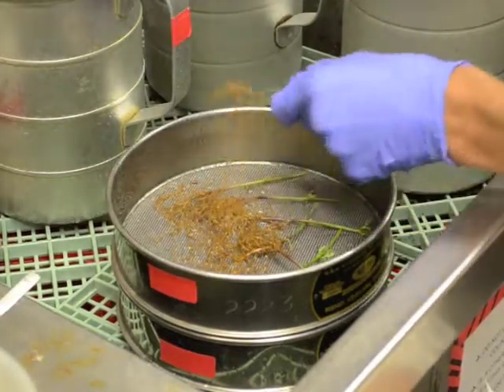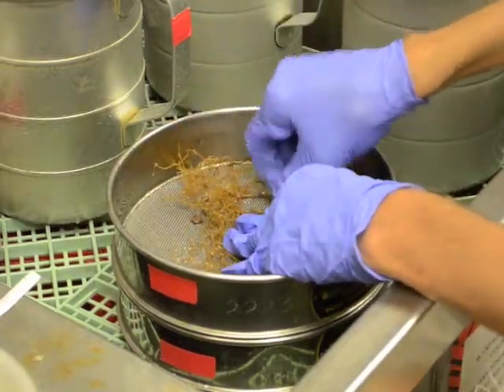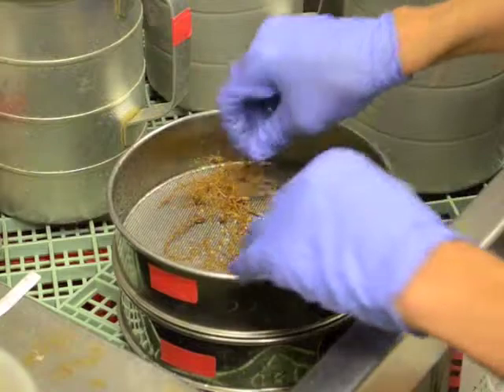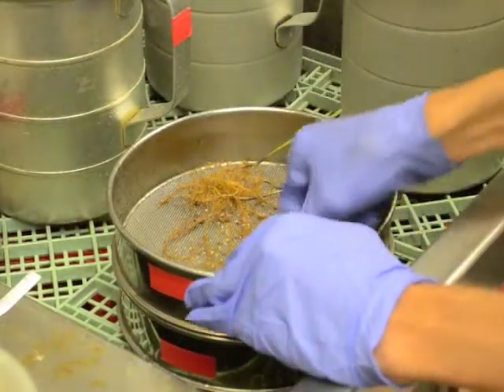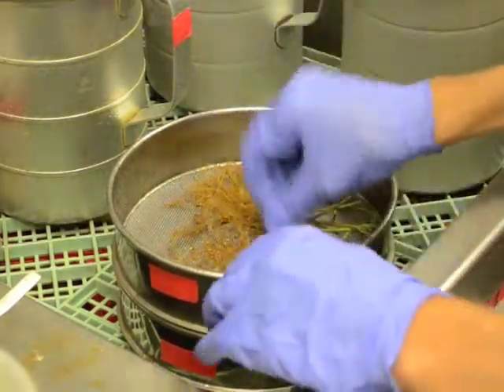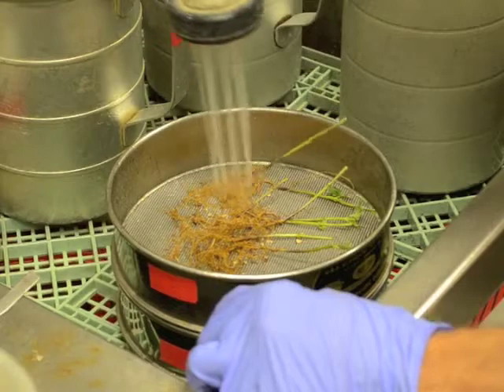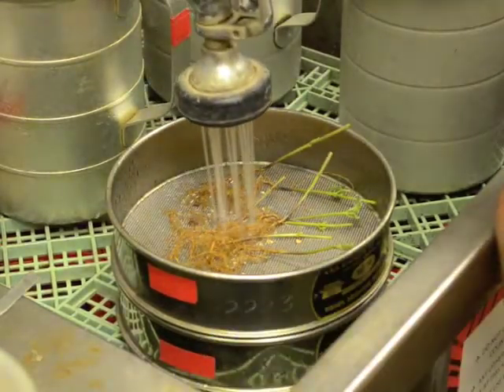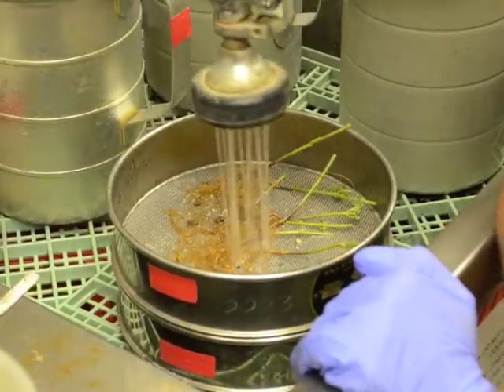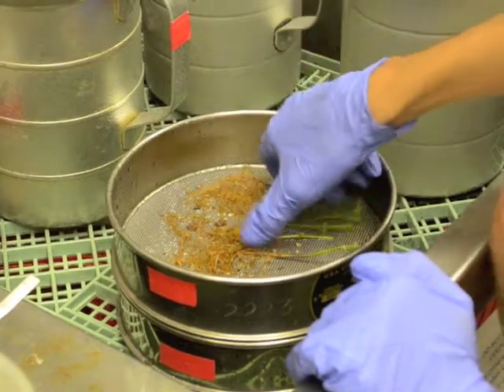Flip the roots over and blast again. After blasting, the roots are no longer needed and can be discarded.